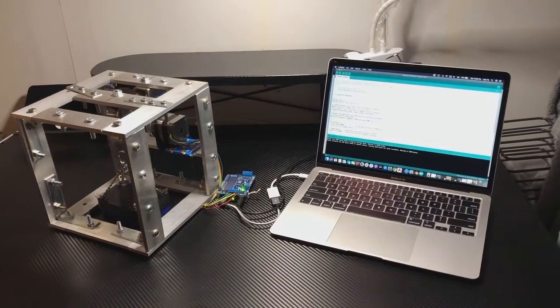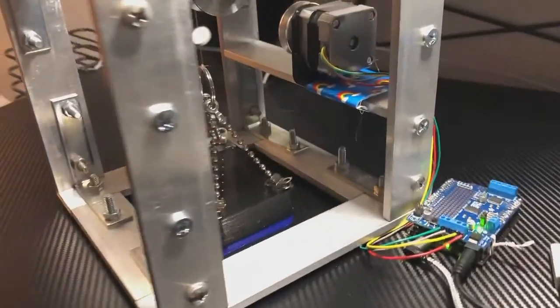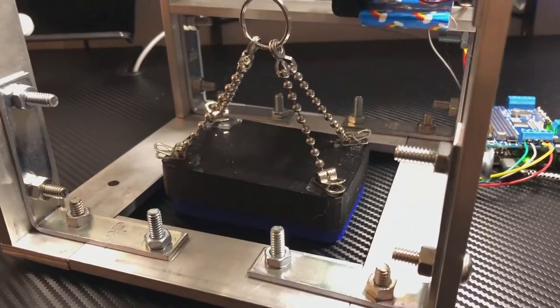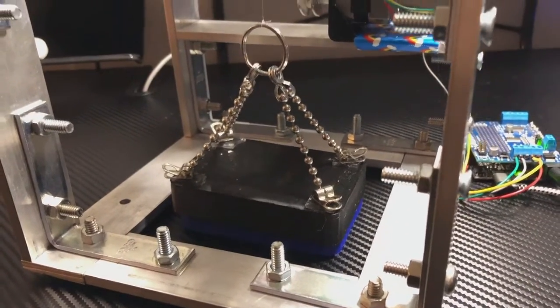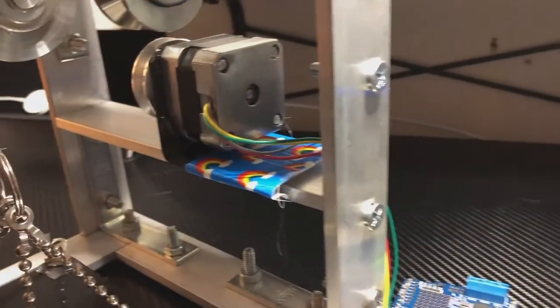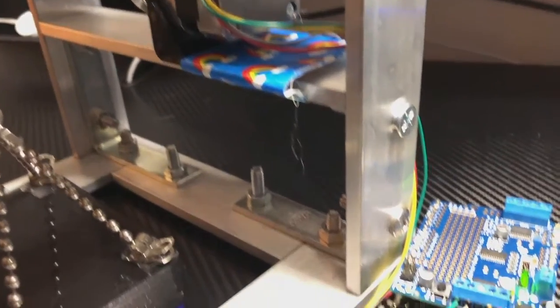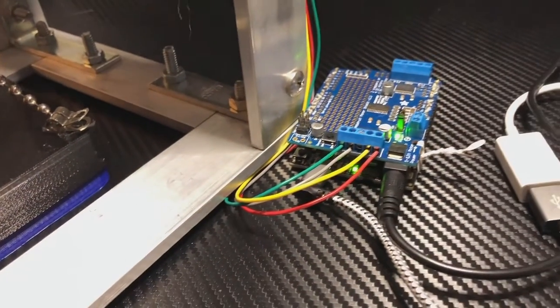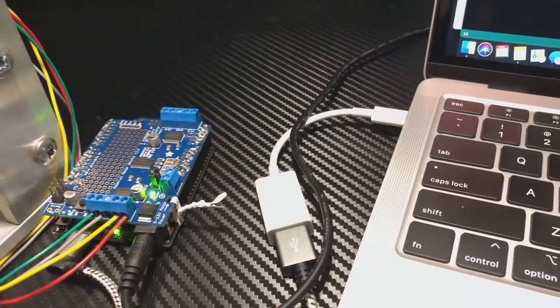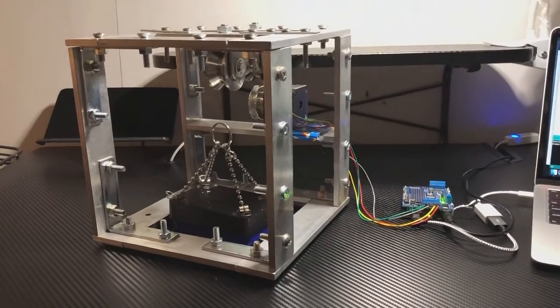This is our most recent prototype of our bioreactor, made in 6 months during the academic year. The cage structure is made of aluminum and various stainless steel parts, mostly from McMaster-Carr or home improvement retailers such as Lowe's or Home Depot. You can see our 3D printed lid and plate, the lid controlled by the pulley system. These parts were printed with PLA during design and prototyping for faster turnaround, but ideally would be made of less quickly degrading material for users. Our pulleys are made of stainless steel, and our nylon thread is controlled by our NEMA 17 stepper motor.